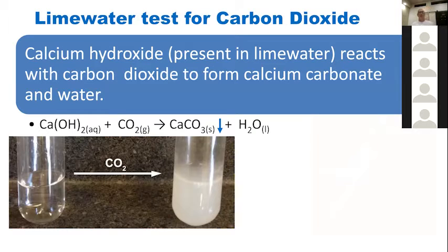So here's the lime water reaction. Like I said, we had a lot of trouble getting this to work, so I'm just going to try and do it myself. But you can use this as saying, this is what it looks like when the reaction takes place. Calcium hydroxide is the compound in lime water. We know calcium has a +2 charge and hydroxide is -1, so the balanced ionic compound is Ca(OH)2. That is a base, because it's got the hydroxide.